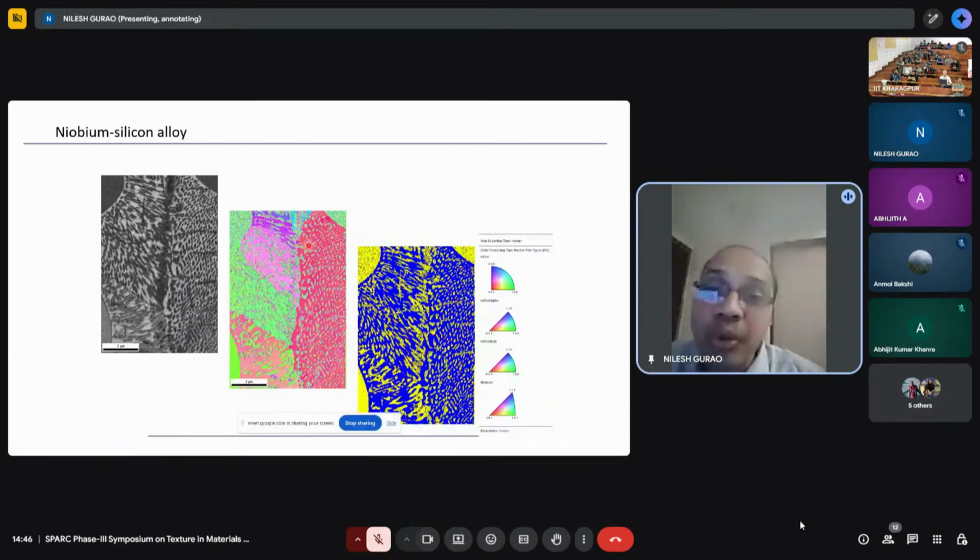Like if you are working on solders, you will have tin. Tin is a body centered tetragonal phase, right? So when to use pseudo symmetry? You should be aware of that. That's why the knowledge of crystallography is important. So please do the homework, then sit at the microscope. Otherwise, it is garbage in and garbage out. And this is something that has to be avoided.